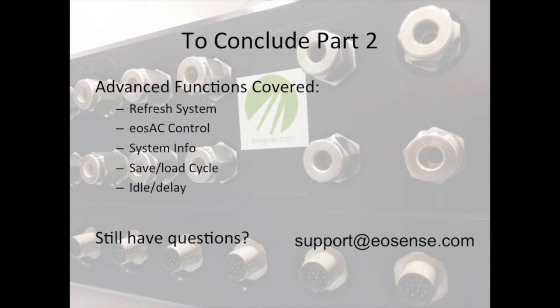So that concludes part 2 of the more advanced functions of the eosLink-MX software. If any issues arise while you're using the software, please refer to the EOS-MX user manual or contact support@eosense.com.